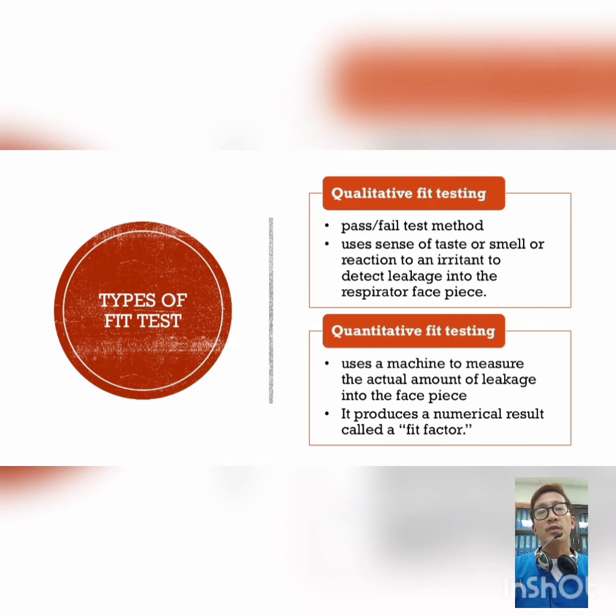If we have the two types of fit testing method available in the hospital, which among the two types is the preferred one? What do you think? The preferred one is the quantitative respirator fit test. Okay? Quantitative. It involves the use of a machine and does not rely on the person's sense of taste, smell, or irritation to the solution.